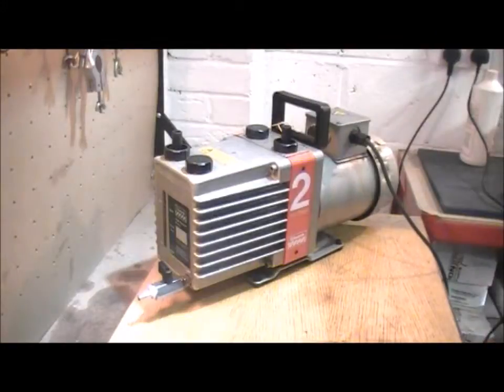Hi, this is Angus at LabVac with a quick rundown on possible oil leaks that you'll find on your vacuum pump.